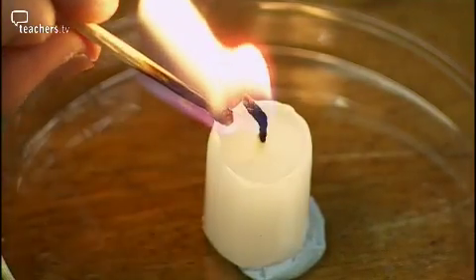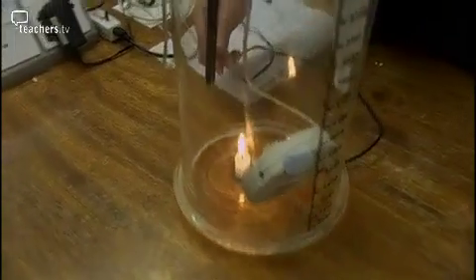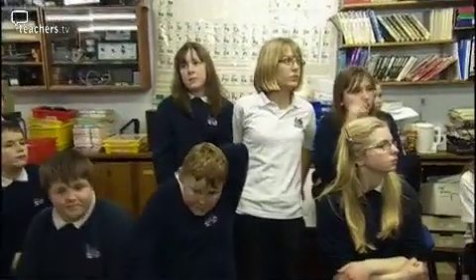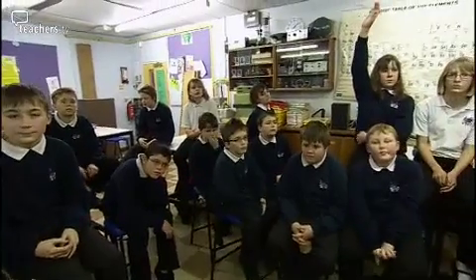Going to watch what's happened and see if you can use very quickly the ideas of what happens with the graph to explain what is going on. Okay? So what's rising? The blue. Moana? The humidity. Good. What's that detecting? The water. Thank you, Cameron. Okay. So we are detecting water. What is happening to the amount of carbon dioxide inside the bell jar? It's increasing. Thank you.